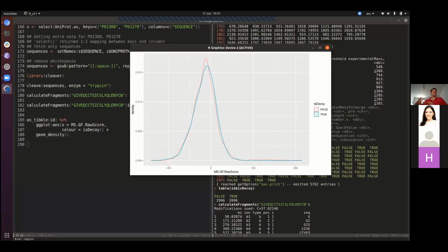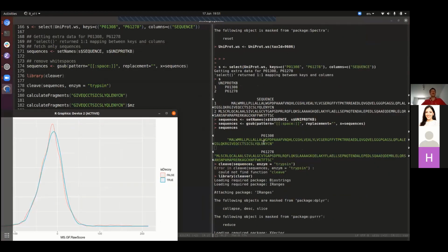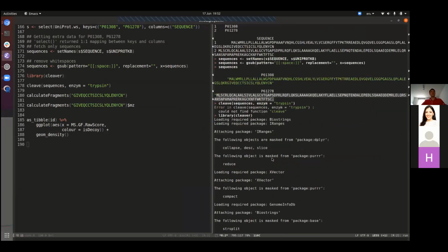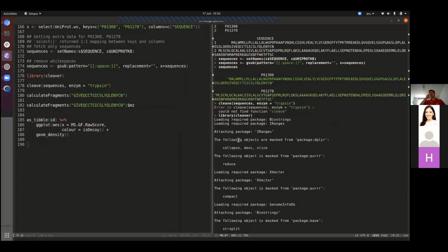So the identification will work exactly as I say, but instead of working on the example that I gave here, which was a very small one so that we could do it manually with 2 proteins, the software is going to do that automatically for you. This will be done on all the proteins of the species of interest.